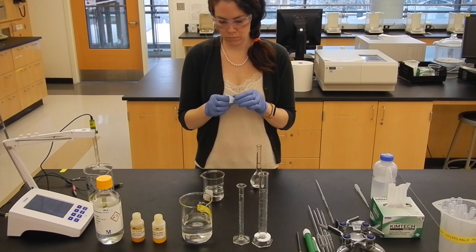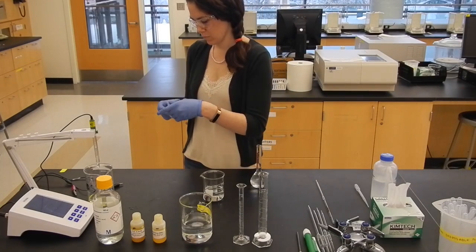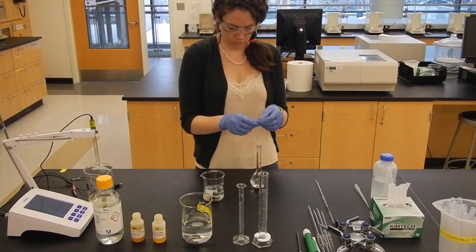Cover the top of the flask with parafilm and invert the solution several times to ensure that it is well mixed.